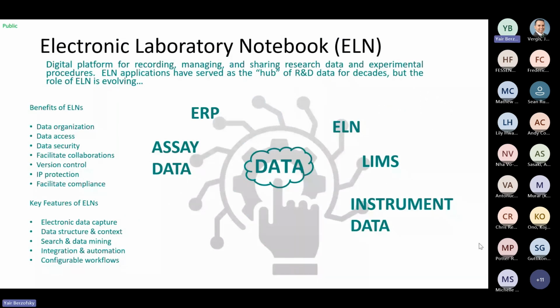So basically, I'm taking you through Merck's journey to moving into the ELN archive system.